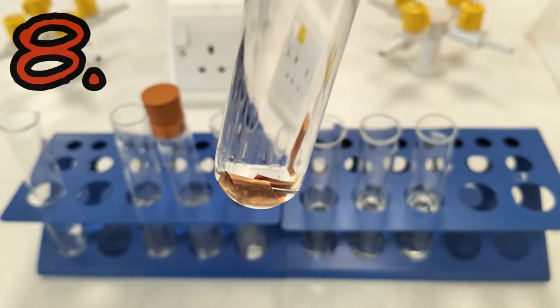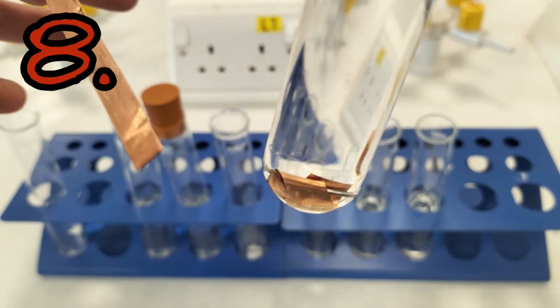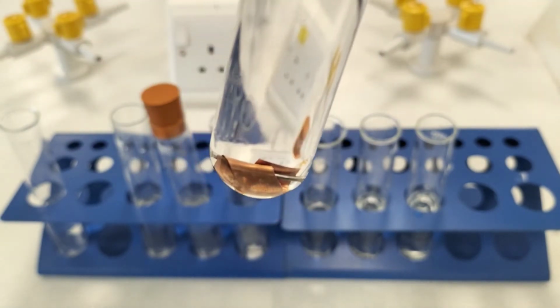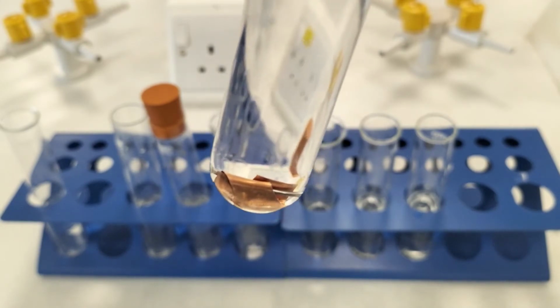And finally, in experiment 8, we've wrapped our iron nail in a different metal. This time we've used beautiful copper as our wrapping in contact with the iron nail. We're going to see if that has an effect on the rate of rusting of the iron nail beneath.